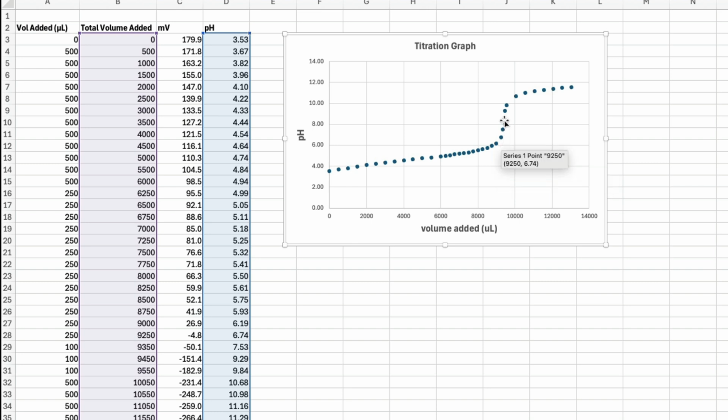So we can estimate, if you look at where the big pop-up starts, it's right at, I'm going to hover over this point here, I think, and this is 0.9000, 6.19. So it's starting at about pH 6.19, and then this is where it slows down. It's ending at about pH 10.68. So halfway in between that would be 8 point something, 8.4. And you can see that would be right about here where we don't have a point.